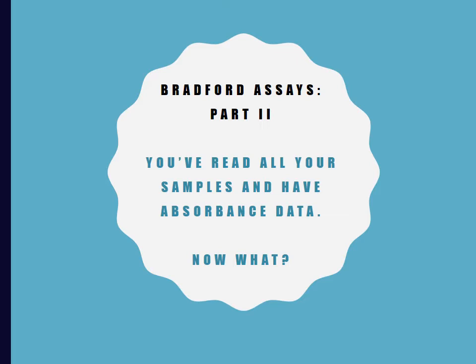Now at this point, lab is done. You've spec'd all of your samples and you've got absorbance data. What now? Come back to this portion of the video after lab and we'll talk about how to use your data to generate a standard curve, how to create that curve using Excel, and then how to use your standard curve to determine the protein concentration of your 2 food samples.